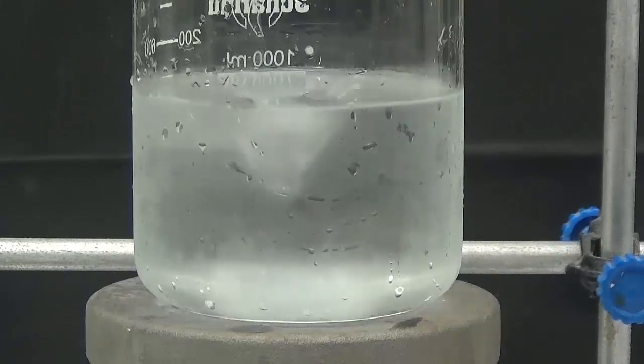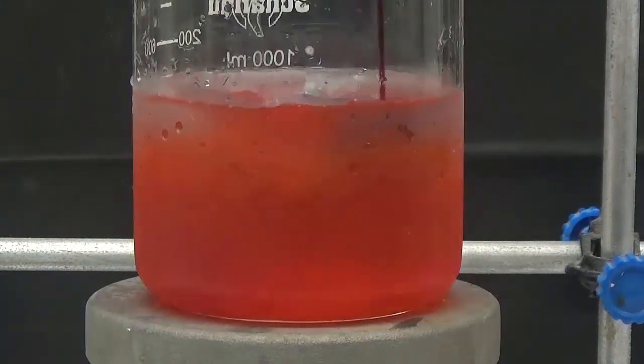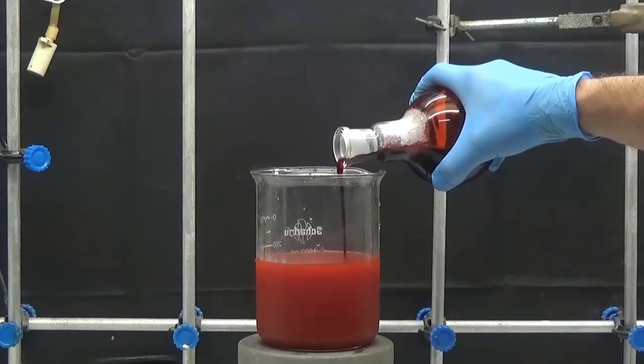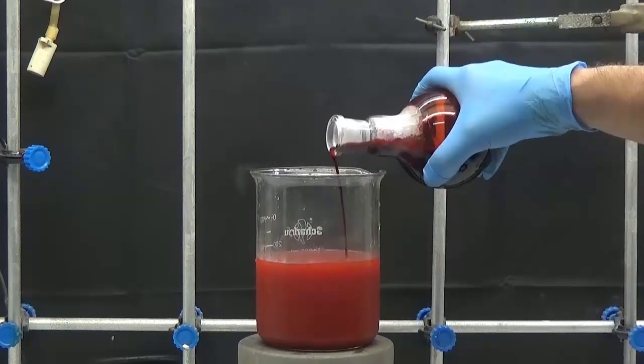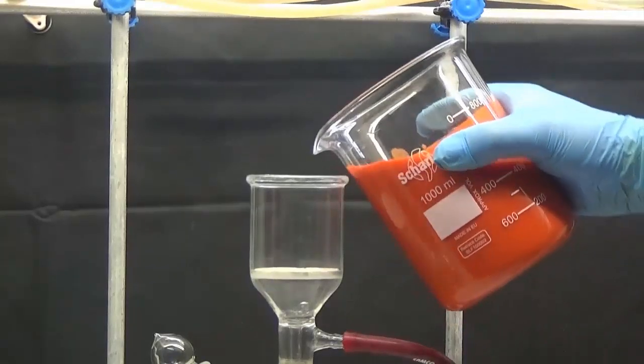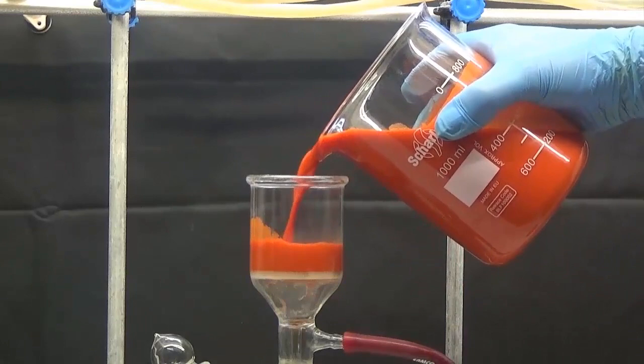Let cool and pour the reaction crude into 500 ml of ice water with heavy stirring. Collect the red solid by vacuum aspiration.